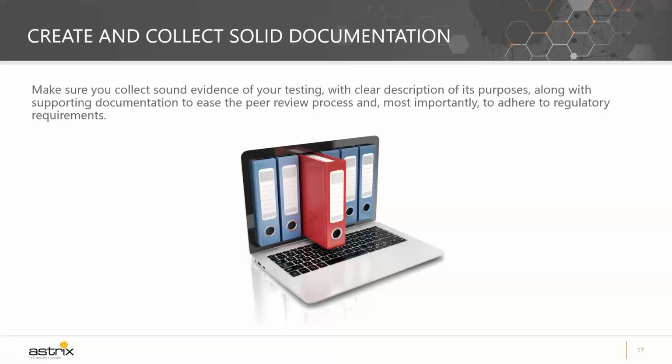The objective of these sets of documents is to demonstrate that the proposed customized calculations execute exactly the way the analytical test method requires your analysis to be calculated. Some of the documentation you need to create and collect as part of your calculation effort includes, but is not limited to, for example, a work instruction. You are creating new calculations in Empower, so people need to operate the system in a certain way so calculations can produce the same results for every analyst. It's good to have a work instruction to assist lab users on how to operate Empower in a consistent manner, producing consistent results.